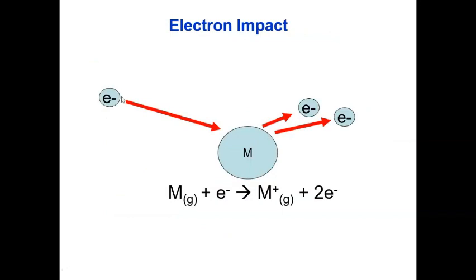This electron from the target metal will collide, or we can say bombard, the molecule or the compound mixture. Then we get an electron from the electron gun, and another electron from the molecule is released. Then we have molecular M plus, or we can say the molecule is ionized.